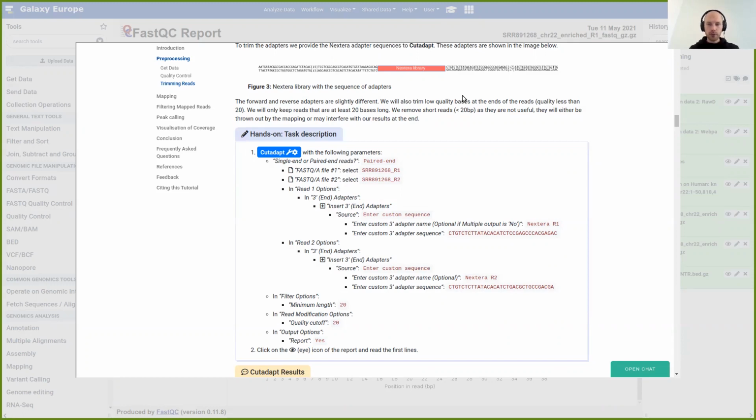We want to remove these reads because later on in the mapping, they are, of course, easier to map, because the sequence is not as unique anymore, and it's therefore very easy to map the read and find the position in the genome. However, because the sequence becomes less unique the shorter it gets, you will have more of these reads mapped to multiple positions, and then you are unsure what the correct position of the read in the genome is.